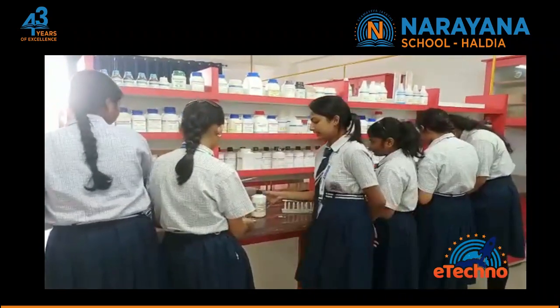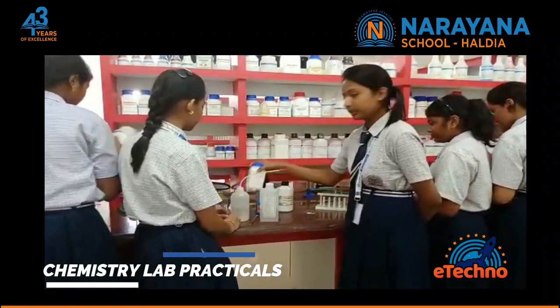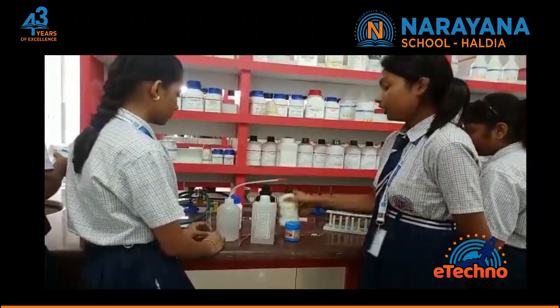These are the required chemicals: distilled water, ethanol, sodium carbonate, baking soda, sulphuric acid, and the organic compound.